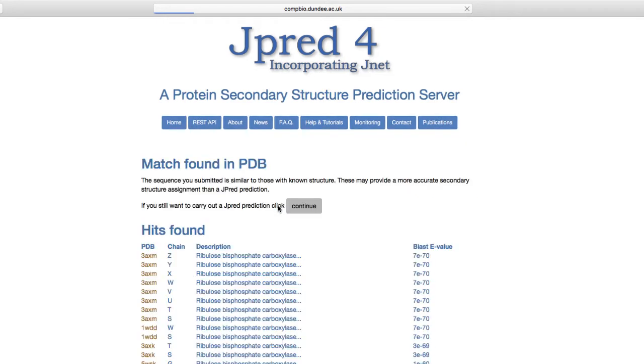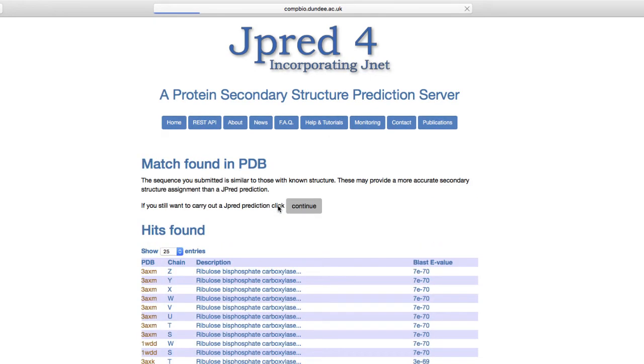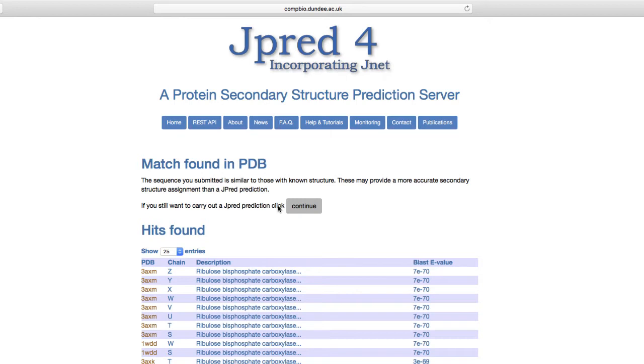By default, JPRED4 first searches the PDB protein databank. If the sequence has sequence similarity to a protein with a known 3D structure, you might want to reconsider the utility of a secondary structure predictor. After the PDB search, to carry out the JPRED prediction, click the Continue button.